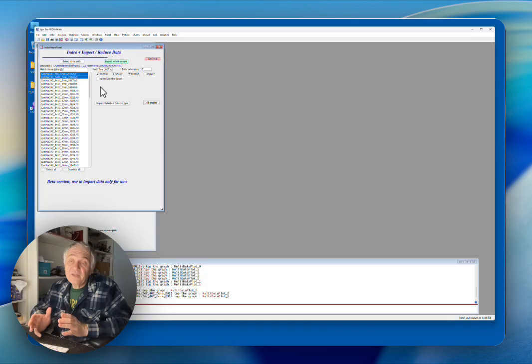And you may not even need that if all you need is USAXS data and are using either your own Python routine or using SasView or anyone else who understands the NXcanSAS standard in the HDF5 files, which could be by now 3 or 4, maybe 5 different applications.